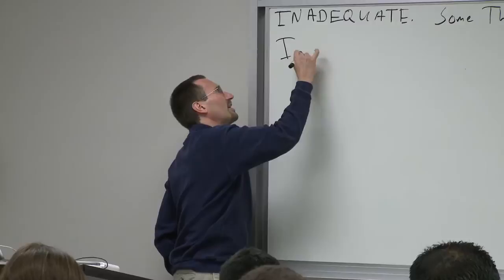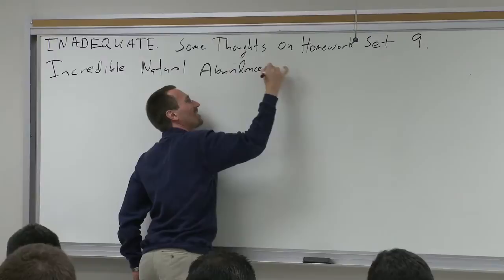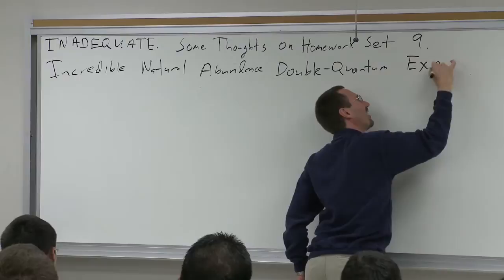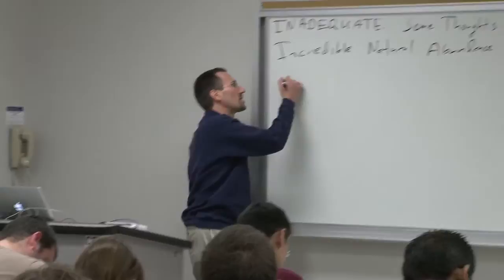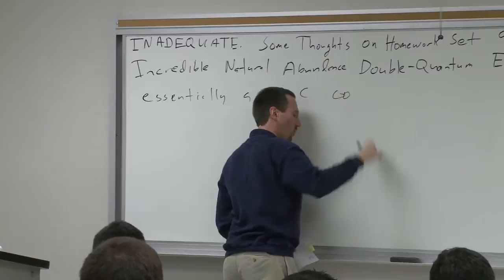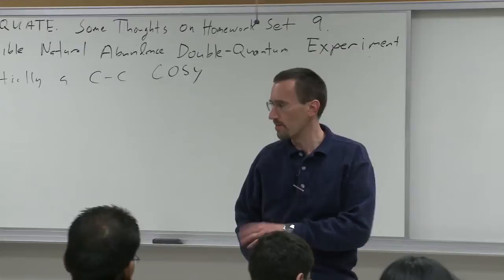It stands for Incredible Natural Abundance Double Quantum Transfer Experiment. And what it is, essentially, is a CC COSY. So it's essentially a CC COSY. And what's so incredibly powerful about this technique is it means that you really can stitch together any carbon skeleton with it.